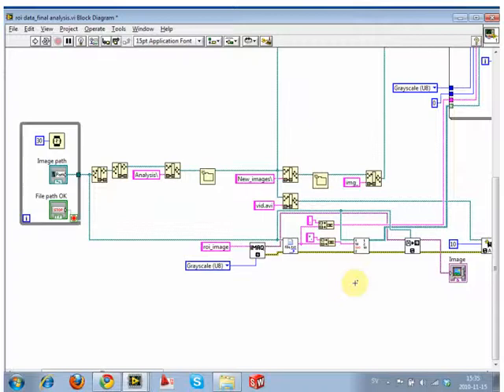So with this, we have the ROI thing. You know, we don't call it, but I could put in my custom, written ROI analysis tool. I'll never call it, but if I've got it in the same one, I'll know that if I open this library file, somewhere in the sub-VI list is my own ROI analysis tool.